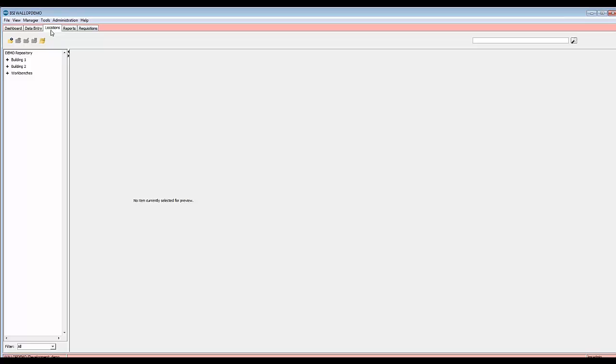We're currently viewing the location tree for the demo repository. BSI is designed to be a multi-repository system, so there can be many different location trees within the same database. Users with the appropriate permissions may log into the different repositories. Specimens can also be transferred between the repositories.